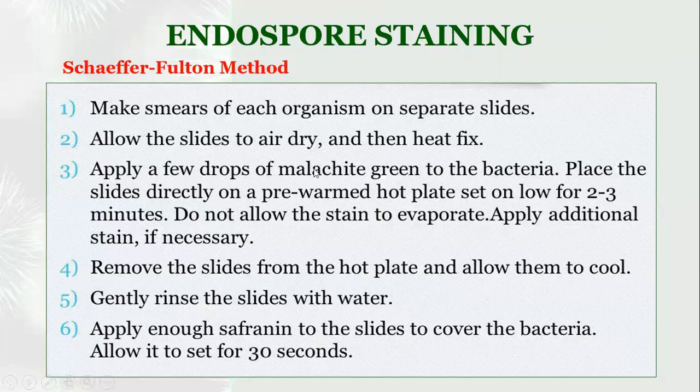Then warm the smear so that it enhances the penetration of the malachite green into the endospores. While warming or keeping the smear over steam, the stain should not evaporate.